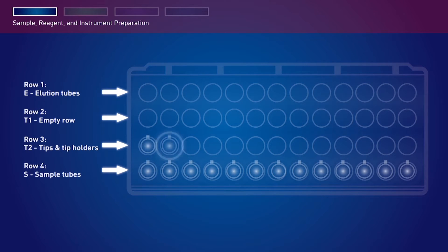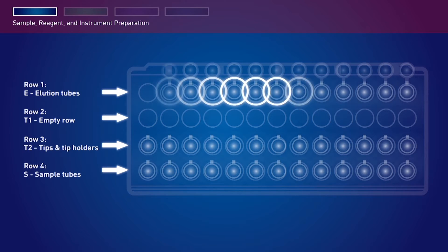In row T2, third row, load Automate Express system tips inserted into tip holders. Leave row T1, second row, empty. Row E, first row, load with labeled PrepSeek kit elution tubes with the caps open and secured as shown here.